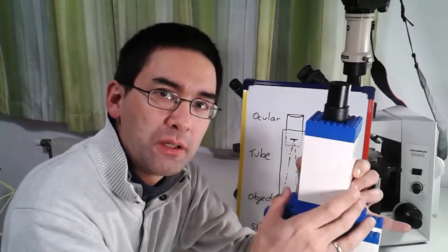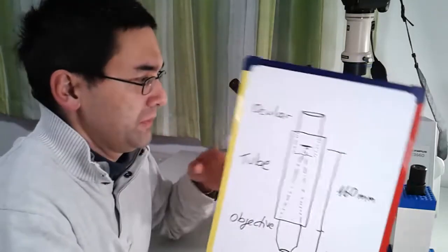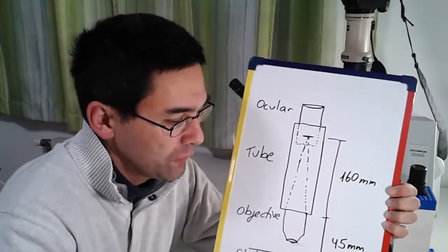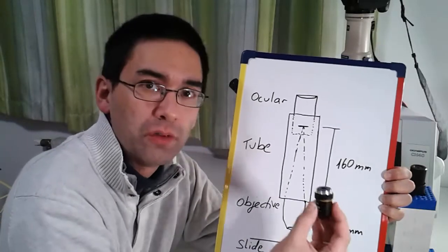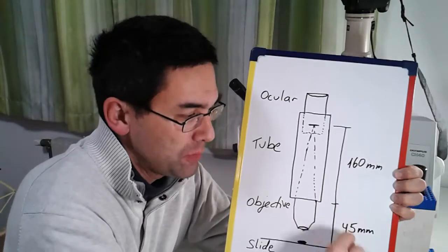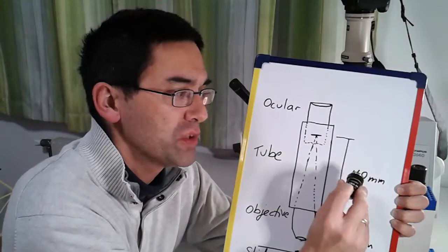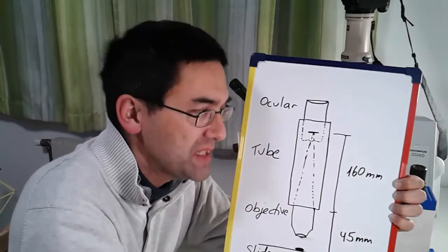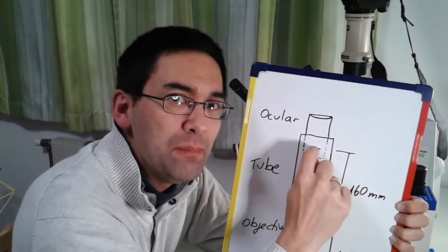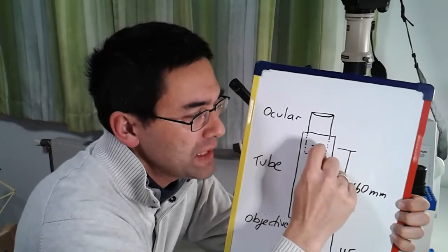Before I tell you how to build it, I have to tell you some dimensions first because that's a little bit important. I've prepared a drawing over here showing the distances of the microscope. First of all, down here we have the objective. What is important is that from the bottom of the tube to the specimen slide, this has to be 45 millimeters. And the tube length is 160 millimeters.